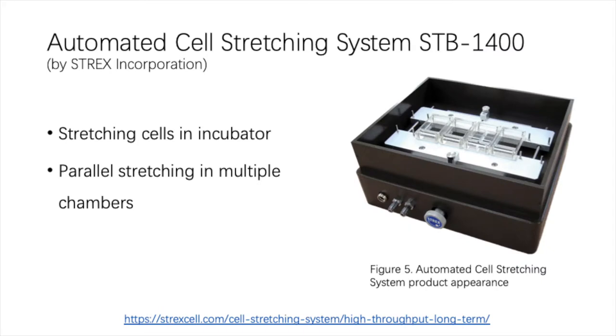Another commercially available device is the automatic cell stretching system STB1400 by Strex Incorporated. In this device, cells are seated in a chamber. This device allows for parallel stretching of multiple chambers within a controlled CO2 incubator.